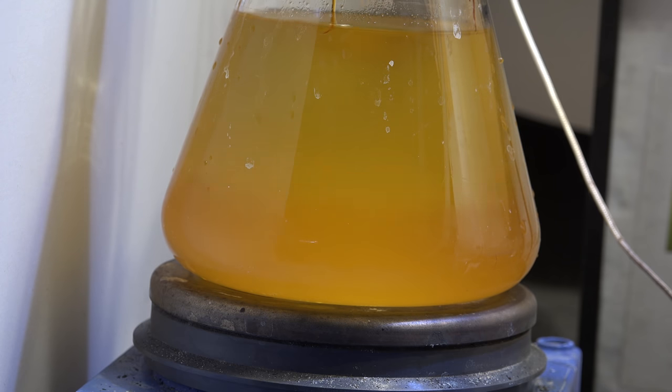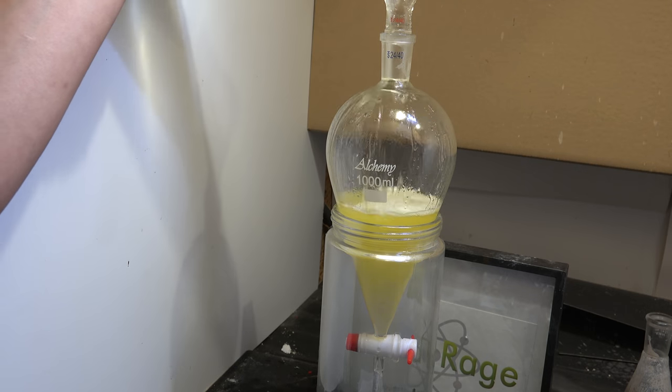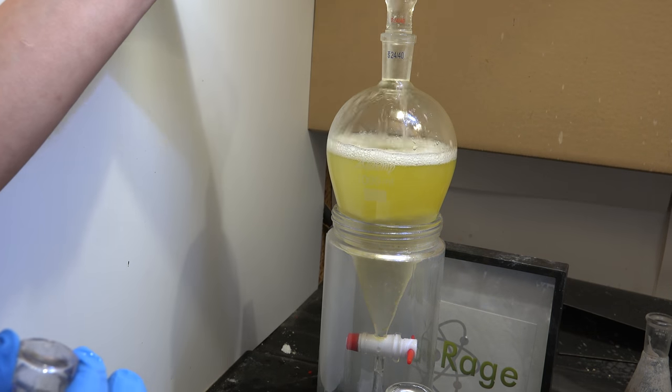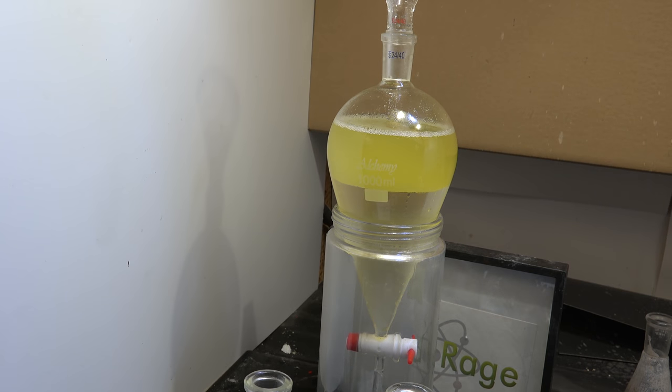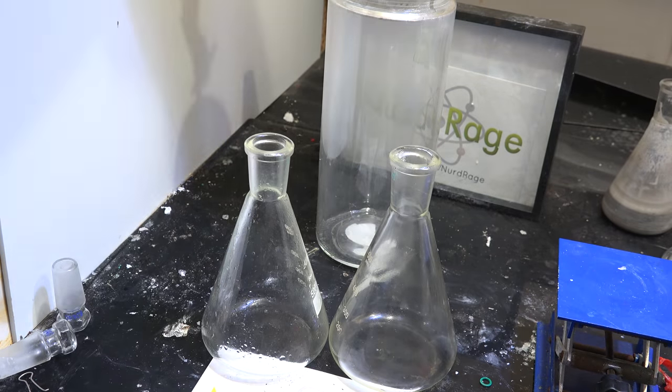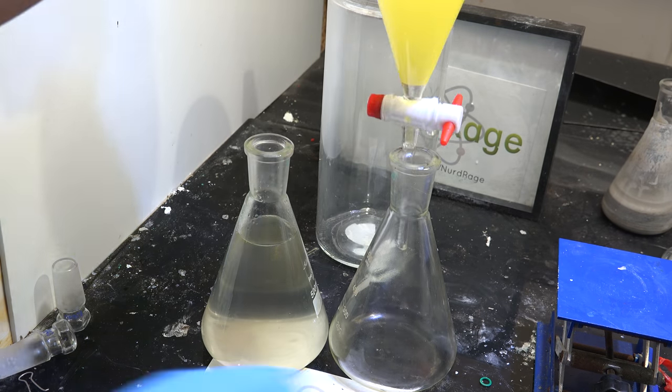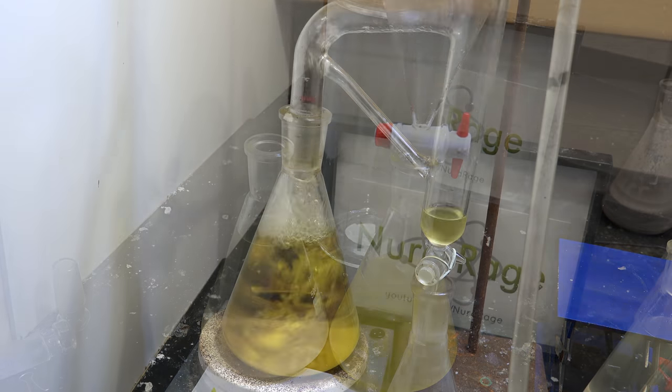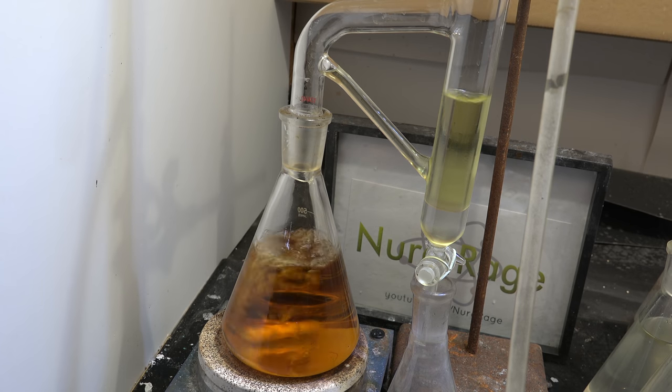Instead impurity destruction with a strong base should be used. First use a separatory funnel and separate out the lower water layer. This is to remove most of the unnecessary volume and make this easier to work with. You might be wondering why I have so much more product in this shot. It's because I had to rerun my reaction from earlier failure of the acid catalyzed hydrolysis. Anyway, at this point you can use a dean stark trap to remove all the remaining water but this is optional.